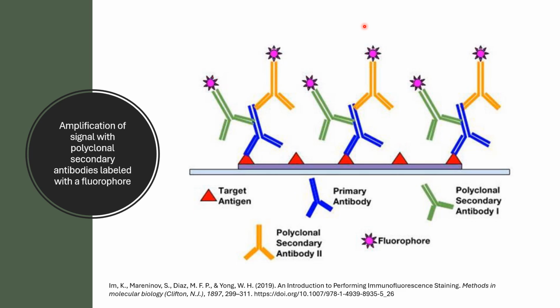Secondary antibodies can be modified and conjugated in multiple ways for purposes of visualization and signal amplification. Commonly, secondary antibodies are conjugated with fluorescent labels which emit fluorescence upon photoexcitation. Enzymatic labels can also be conjugated to react with chromogen substrates for colorimetric analysis.